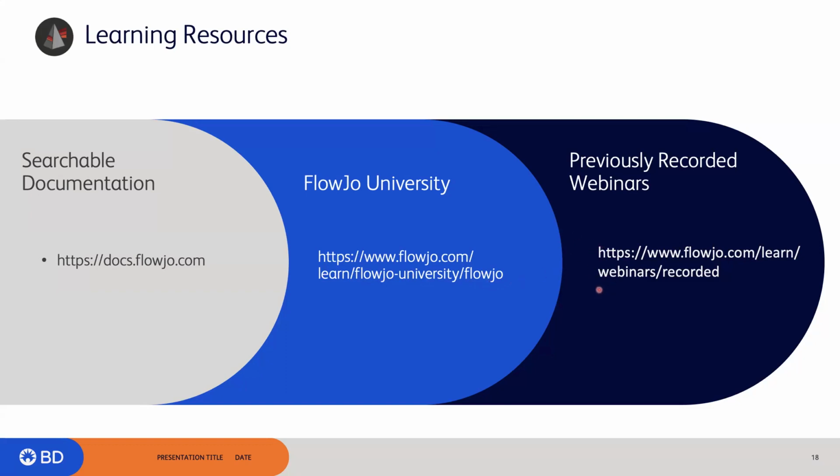And then we have a lot of pre-recorded webinars as well. So if you wanted more in-depth information about BD Research Cloud, there was one at the beginning of the month that I'd recommend taking a look at. That's a great one, and there are other ones, like high dimensional analysis and FlowJo, others similar to this, about using BDRC with FlowJo. So lots of great information there.